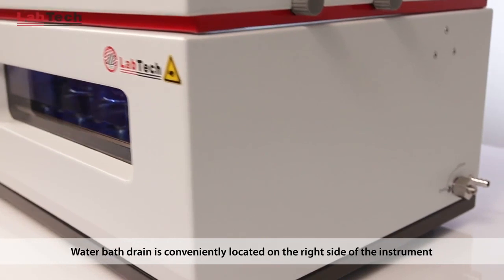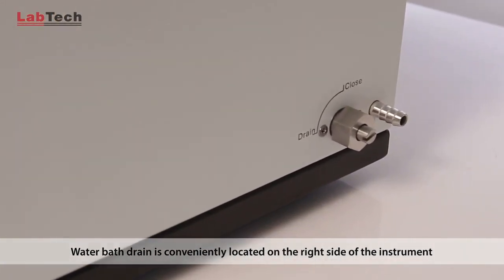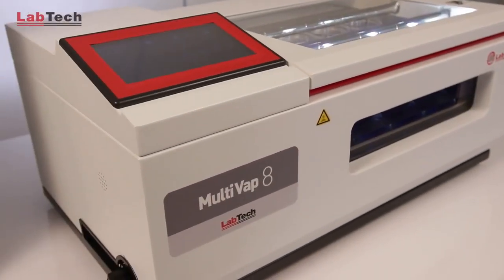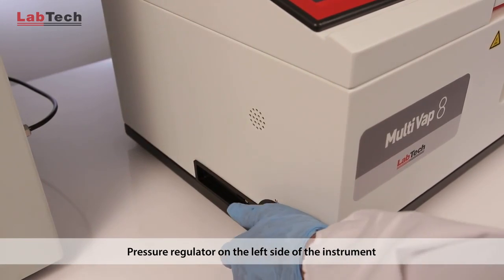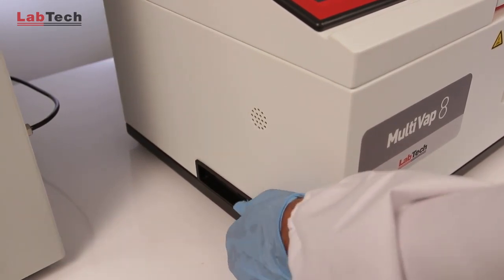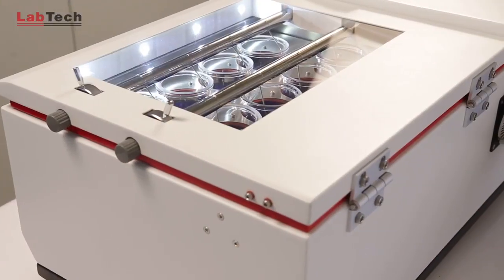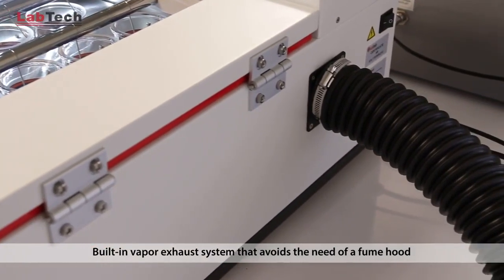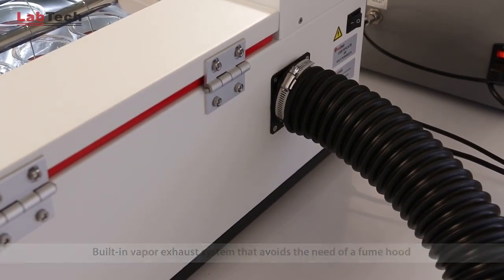The water drain bath is conveniently located on the right side of the instrument. The pressure regulator is on the left side of the instrument. On the back of the instrument is the built-in vapour exhaust system that avoids the need of a fume hood.